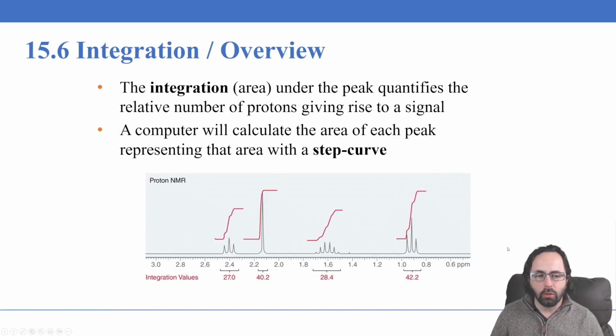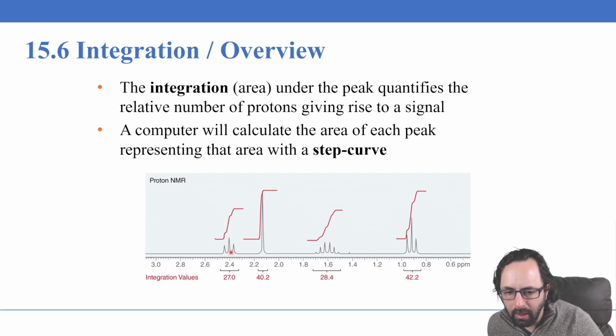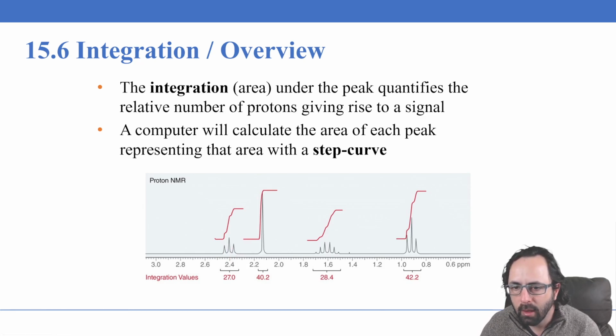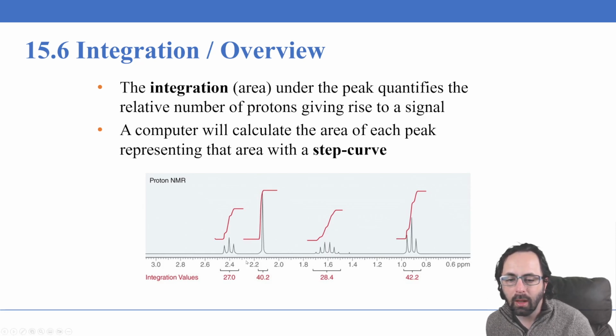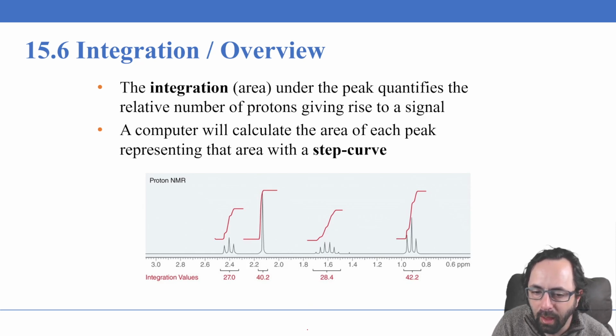Now, besides the chemical shift, what we'll also be interested in is the integration, or the area under the peaks. When you sum up all of the areas under these peaks, these will tell you how many protons this signal corresponds to. This is going to be different for every spectrum, so we can only compare these in terms of their values relative to one another. So when we want to analyze these, we look for the lowest integration values, and we compare everything else to those.